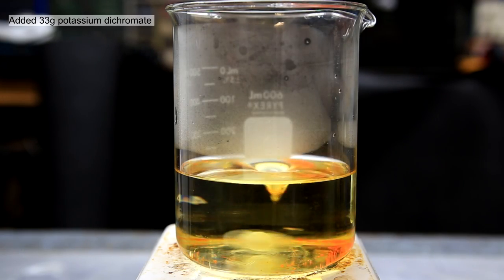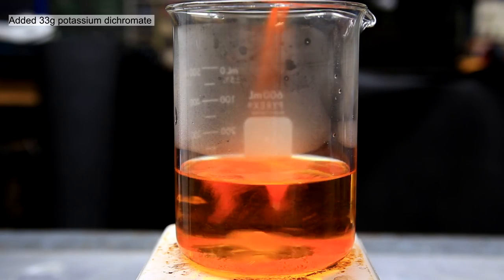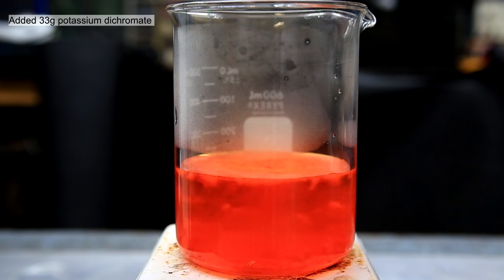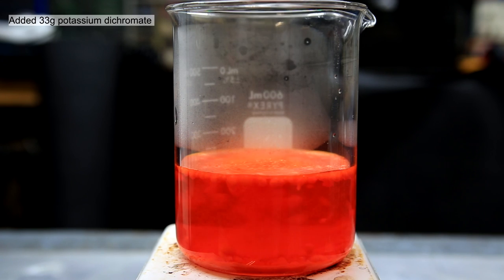Once this was done, 33 grams of potassium dichromate was added. The addition of the dichromate is in no way exothermic so you don't need to add it slowly and it can simply be dumped in all at once.